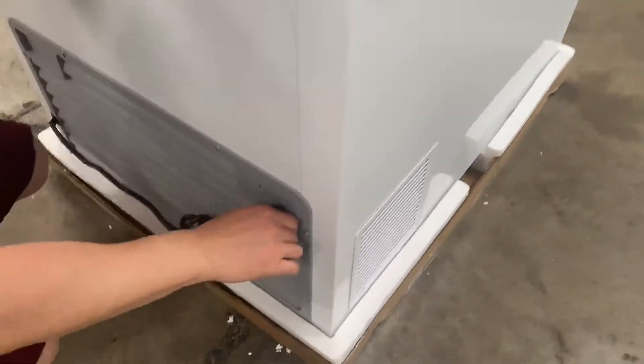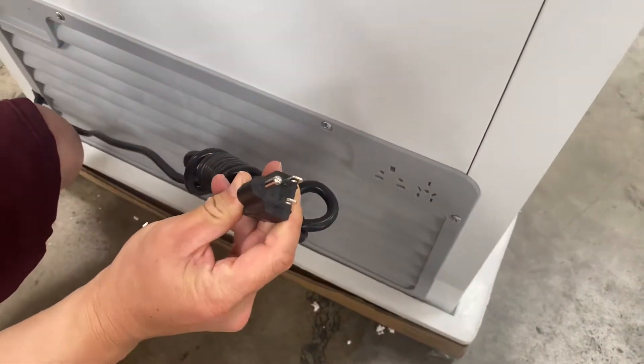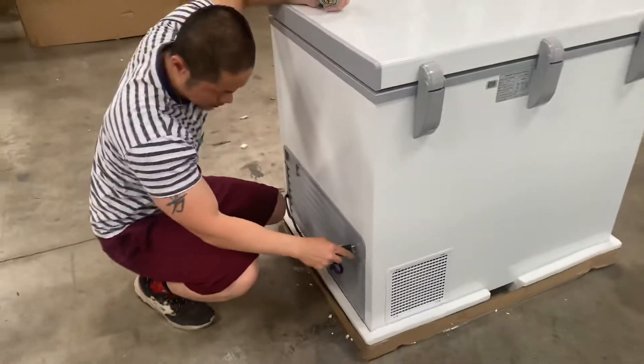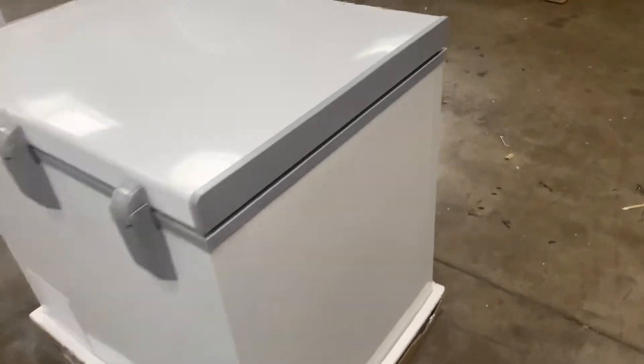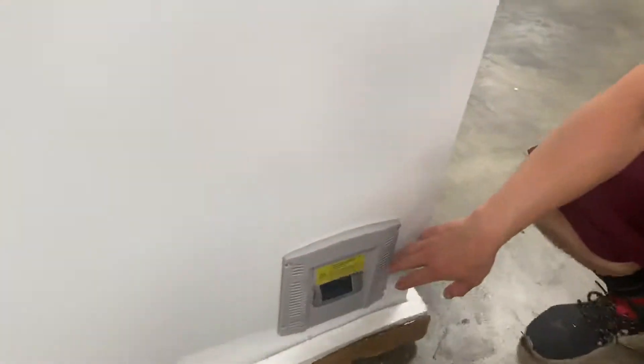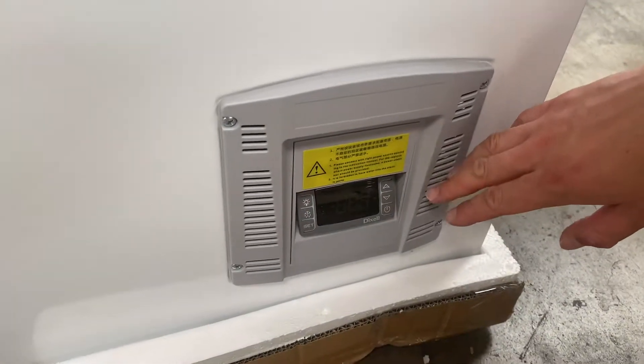Over here in this corner is your 110/120 volt outlet. Last but not least, over here in the bottom lower right corner is your analog temperature control.